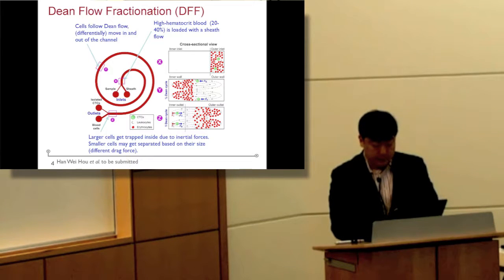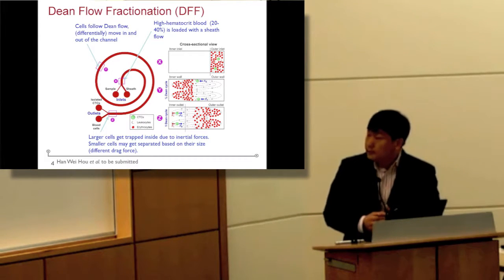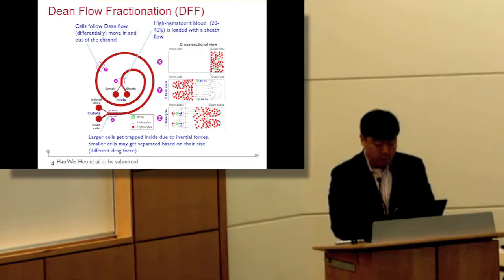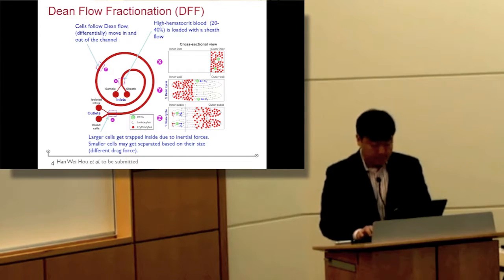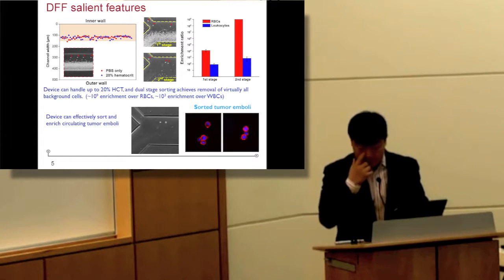The details of the idea are probably beyond the scope of this talk, but suffice it to say that it utilizes the very simple idea of a spiral microfluidic channel where the blood or slightly diluted blood is injected into the channel at a very high speed. And because of the delicate interaction between the fluidic channels and the cells, all these background cells, such as red blood cells and white blood cells in this particular case, can be segregated into one side of the channel in this outlet, while the target cells, in this particular case the CTCs in the blood, can be focused on the other side.